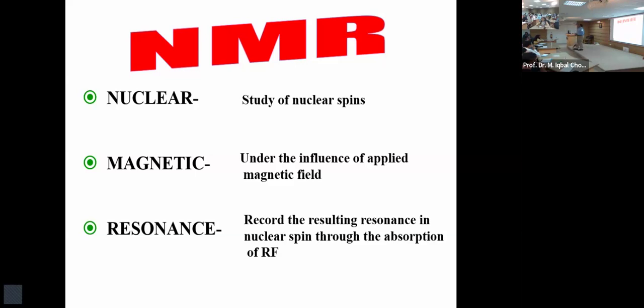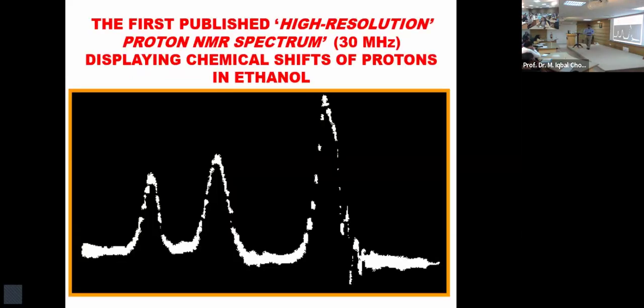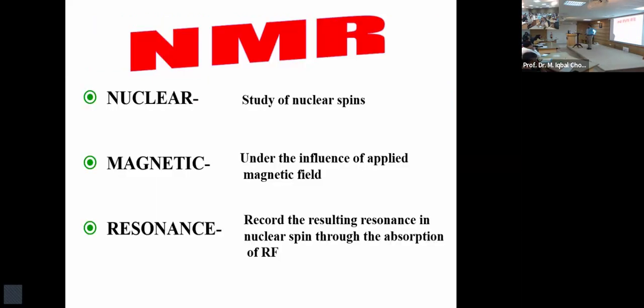And this is the reason why you get different kinds of information about your sample, which is invisible, tiny, infinitely small, and that eventually leads to collective information. The NMR spectroscopy is by various factors a weak technique.